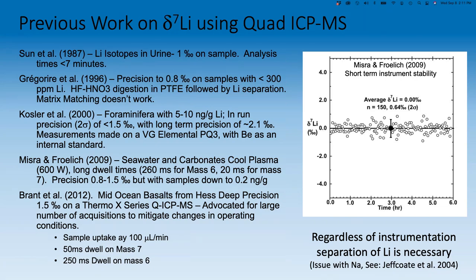From my experience, different isotopes have their own issues. Lithium, as you said, has no interferences like polyatomic, but there are ionization effects, right? Oh yeah. And so different elements will have different issues, maybe polyatomic overlaps or whatever, based on the matrix. Yeah. And then there's the chemistry of the other systems that have multiple isotopes too.